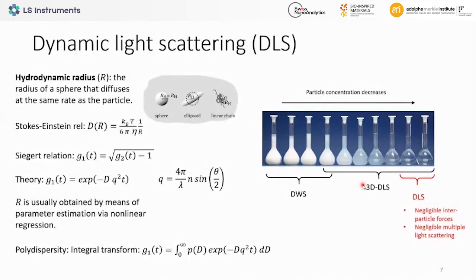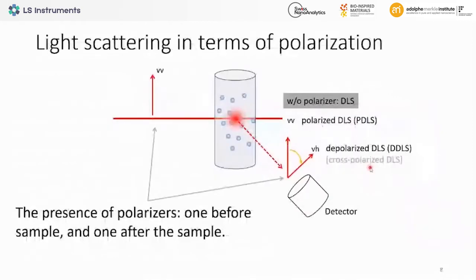But this is not the subject of this study. What I just want to say is that, keep in mind, we always think of samples like this as fairly transparent optically. If it has color, it's not a problem in itself. The problem with DLS is when the sample becomes turbid; then one has to use so-called 3D or cross-correlation DLS. Okay.